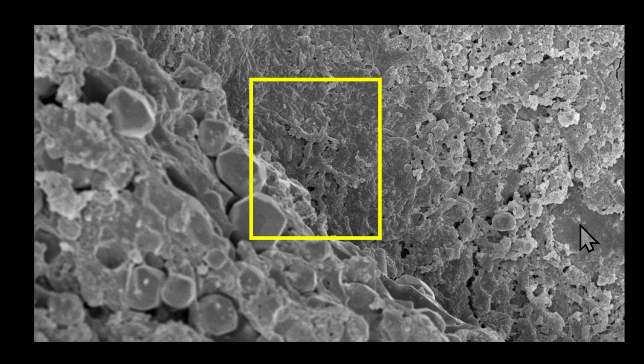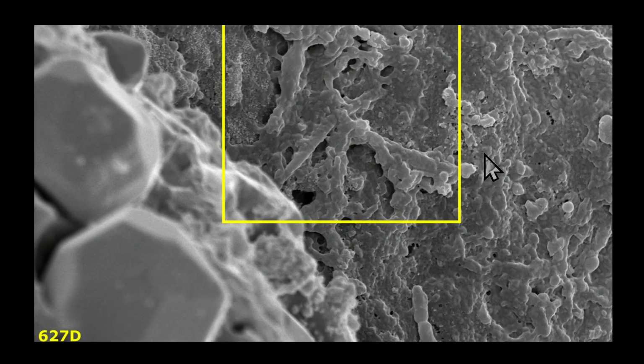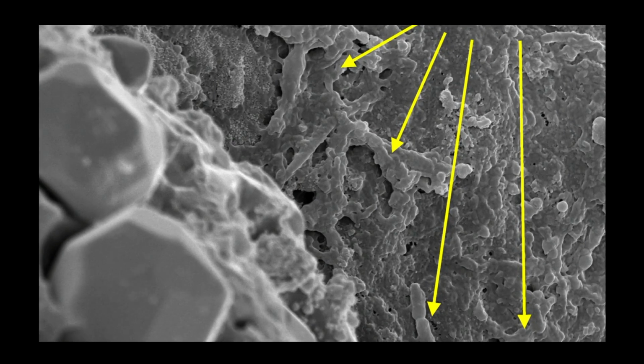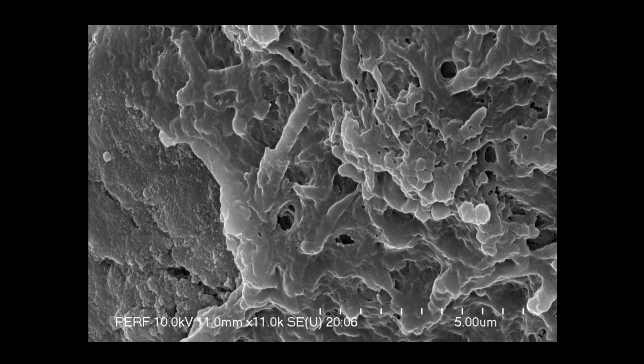And when you look at this, the future tutorials will show you how to identify this not as decalcifying predentin, but as bacterial biofilms. So these are actually bacterial biofilms present on top of the mineralization front, as opposed to this, which looks like a bacterial, but it is just demineralizing predentin.